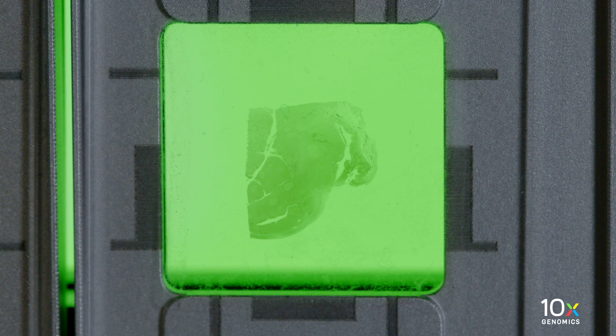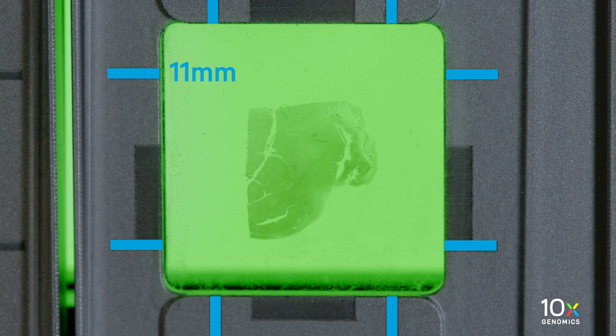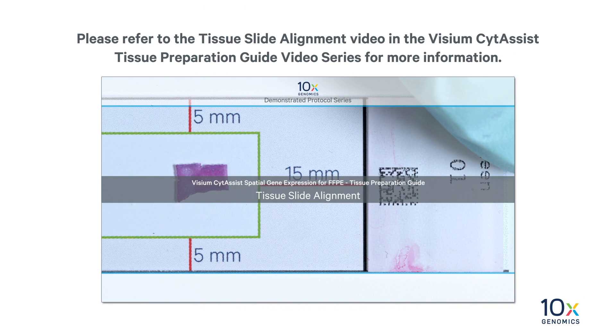In this video, we are using 11-millimeter slide assist slides. Therefore, the tissue is aligned with the 11-millimeter guides, not the 6.5-millimeter guides. Please refer to the tissue slide alignment video in the Visium slide assist tissue preparation guide video series for more information.